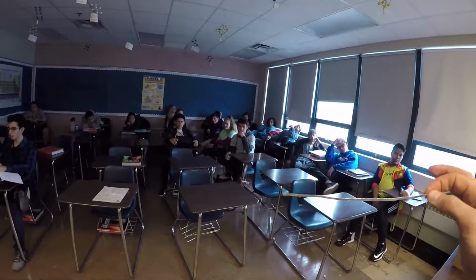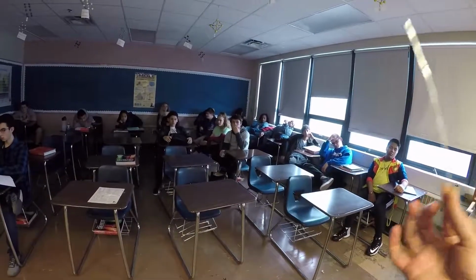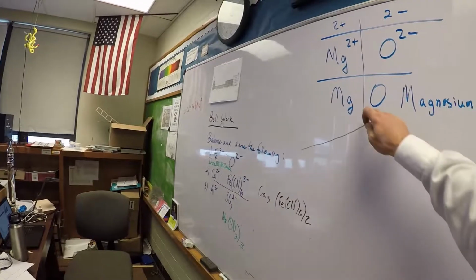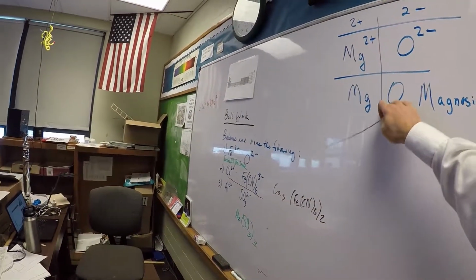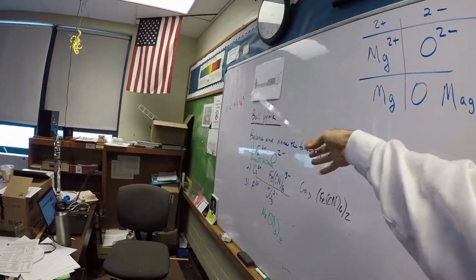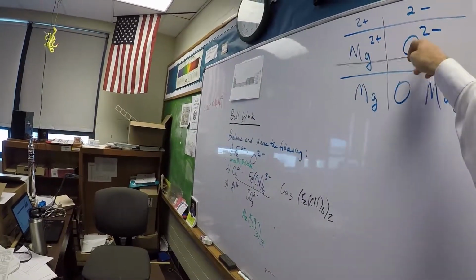When you put flames on this, it'll take at least 30 seconds before it ignites. And when it ignites, that's when you start producing this ash. You're going to be making magnesium oxide today. That's the ash. But when you're firing it, you're trying to give it some ionization energy so it forms this ion, then it can react with this.